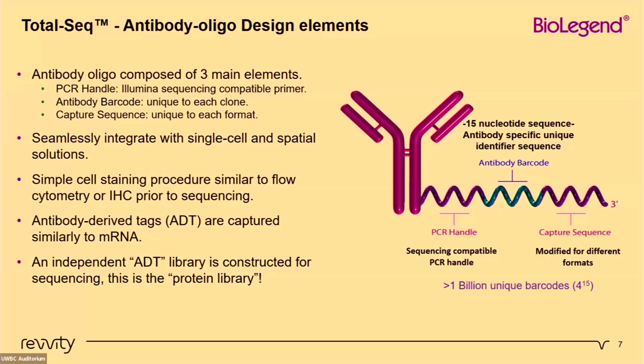And these antibody-derived tags, or ADTs, are captured pretty similarly to mRNA. And then at that point, we have an independent ADT library that is constructed for sequencing, and this is called your protein library.